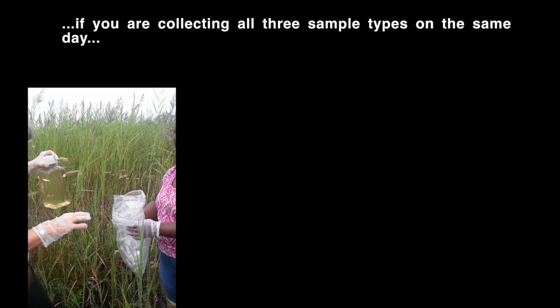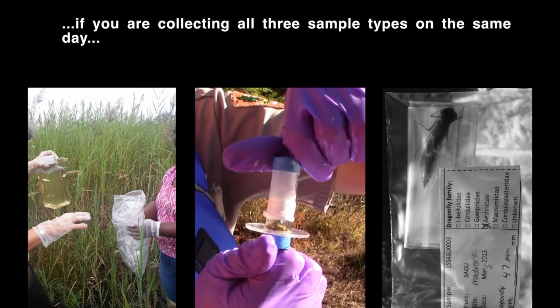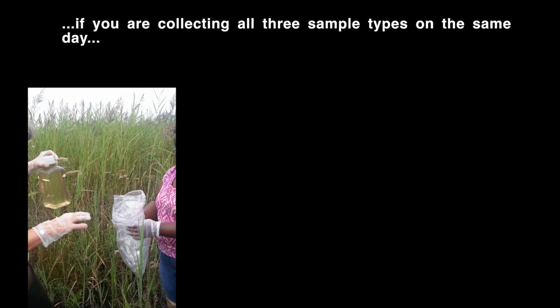If you are collecting all three sample types on one day — water, sediment, and dragonfly larvae — collect the water first. This sample is the most sensitive to contamination and needs to be collected before anyone goes in the water, before any possible stirring up of the site.